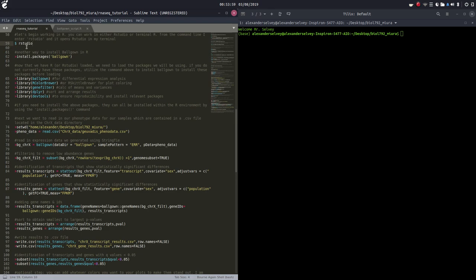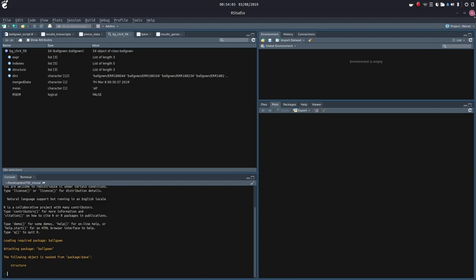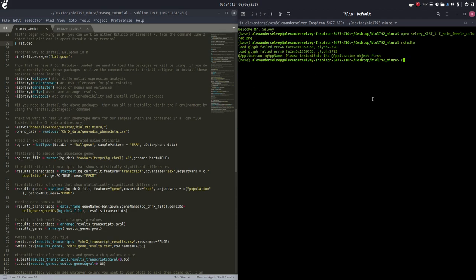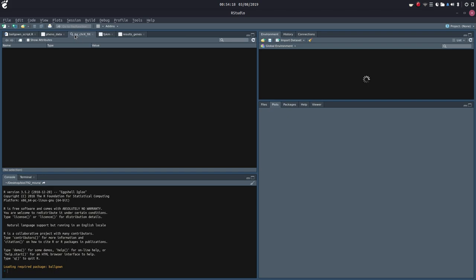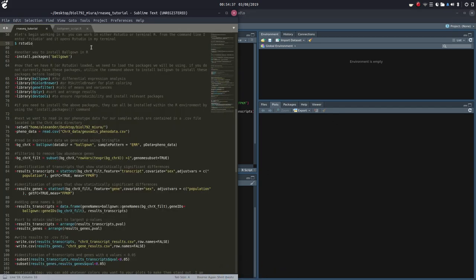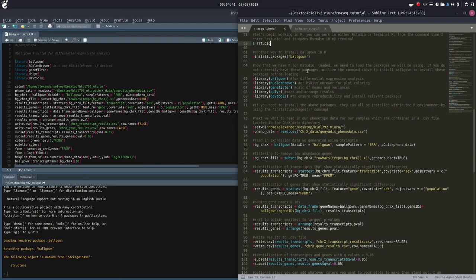Anyway, that was a little tangent. So we've typed in RStudio — let's open up a fresh RStudio workspace. As you can see, I've got my R script in here. Just for the sake of running the code, it's not annotated, but I'll go through the annotations as we run the code. I'm going to put this on one side so we can see the running code here and look at our annotations over there. We can install our package ballgown using the install.packages function in R.